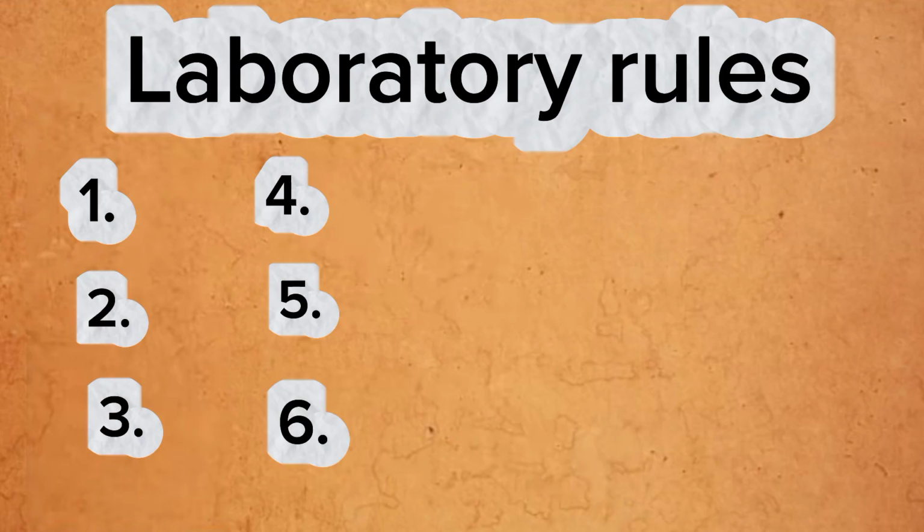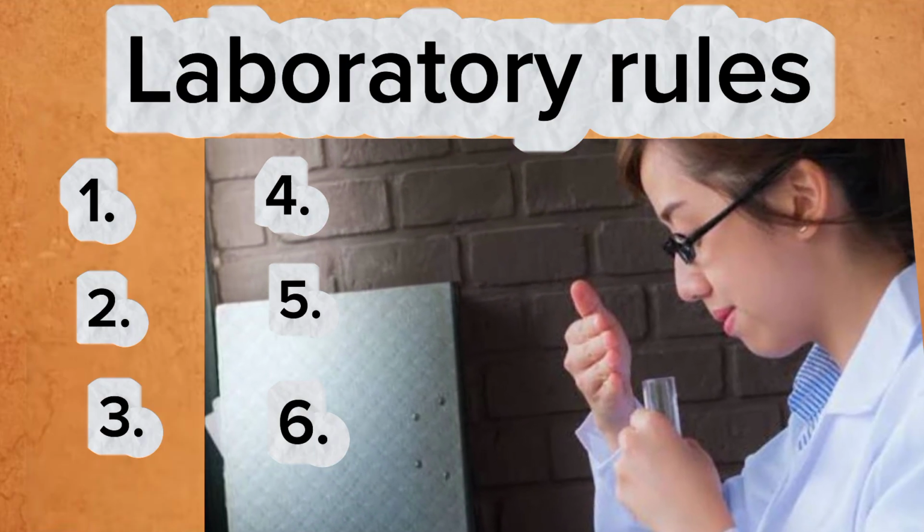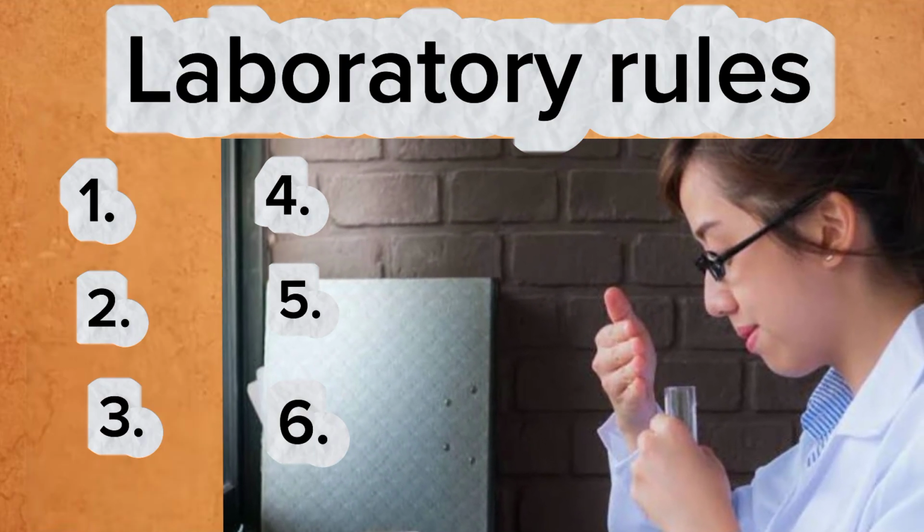Then do not do what? Do not smell a gas directly from a gas jar. Instead, waft it towards your nose with your hand. Waft it, as you can see on the screen. Hiyo ndio inaitwa waft.